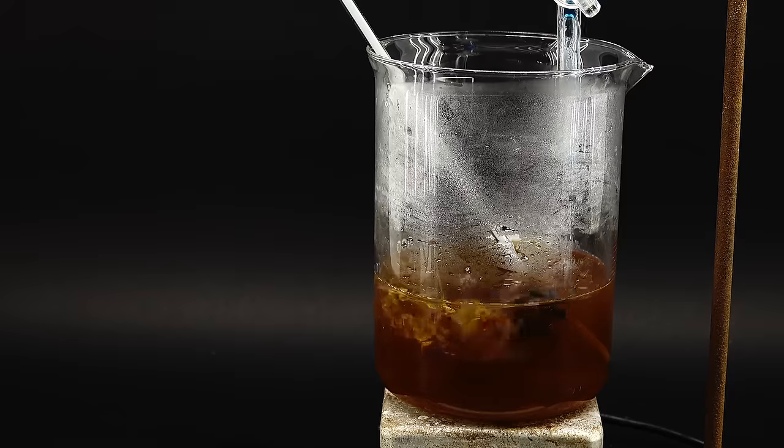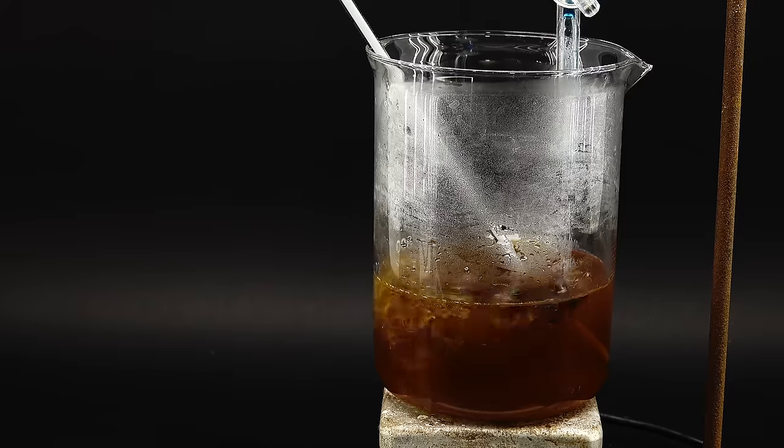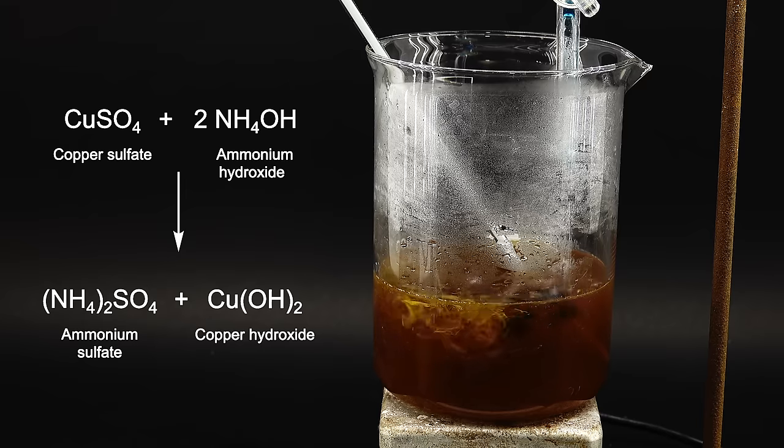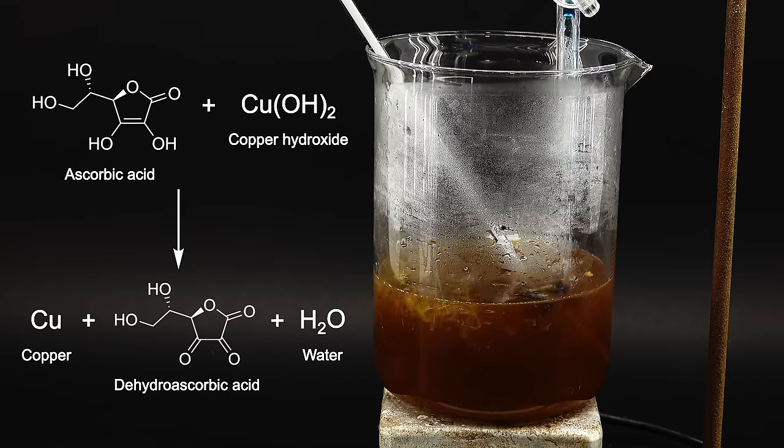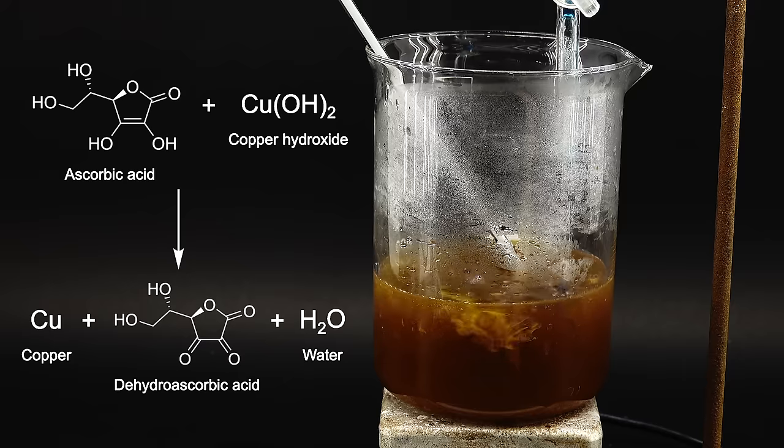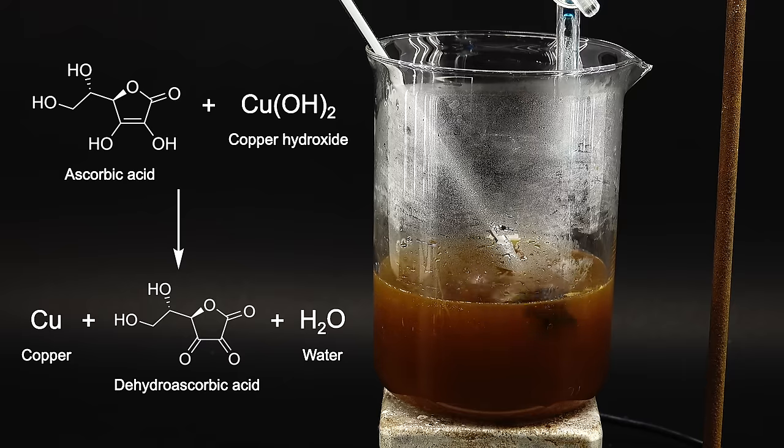In terms of what's happening here on a chemical level, first, copper sulfate reacts with ammonia, forming copper hydroxide and ammonium sulfate, then the ascorbic acid, which under these conditions is a strong reducing agent, reduces the copper hydroxide to metallic copper, itself becoming dehydroascorbic acid, which is its oxidized form, and you can think of it as vitamin C on retirement.